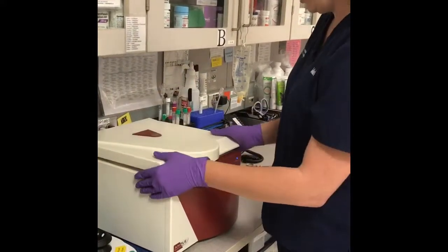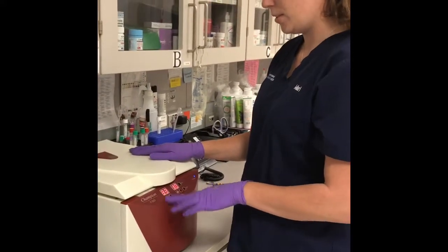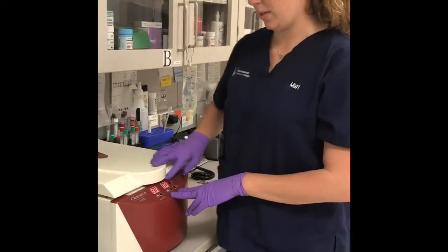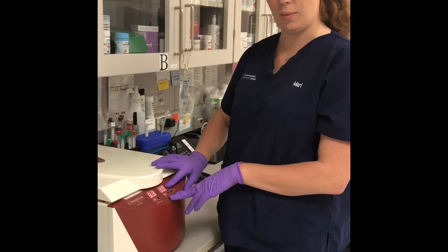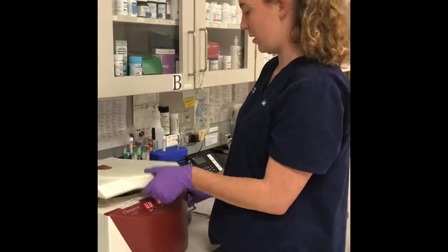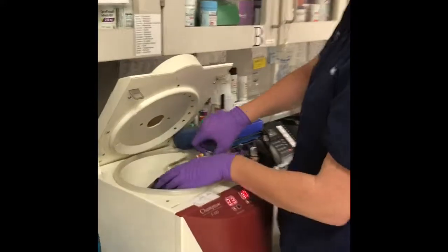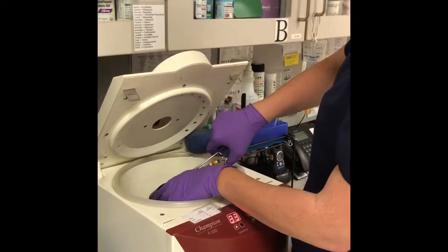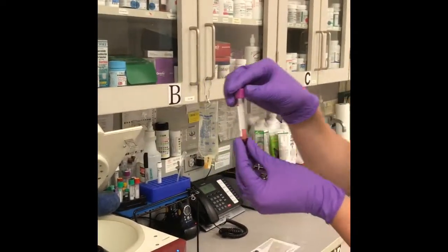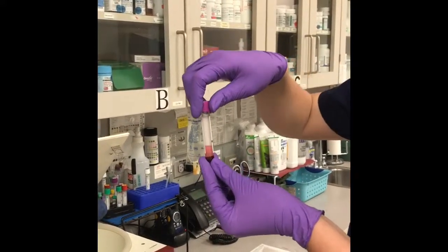Close my top, and I am going to use the manufacturer's recommendations for whole blood while spinning. So we're going to do 3,300 RPMs for 10 minutes. I'm going to go ahead and start that, and we'll be back once it's finished spinning. Alright, so now that our sample is finished spinning, I'm going to go ahead and harvest our plasma. So, take my sample out. Looks like we've got a fairly clean plasma sample, maybe slightly lipemic, but overall pretty good.